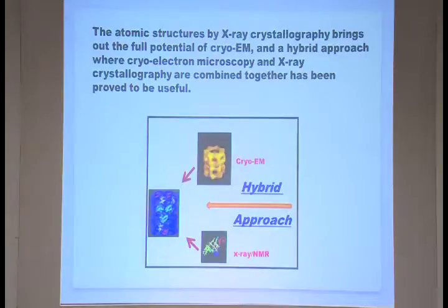That is the hybrid approach that Dr. Natesh already mentioned: molding the crystal structure or NMR structure into the medium resolution map. That's the routine work in the cryo-EM field, at least it used to be, and now also it has some application.